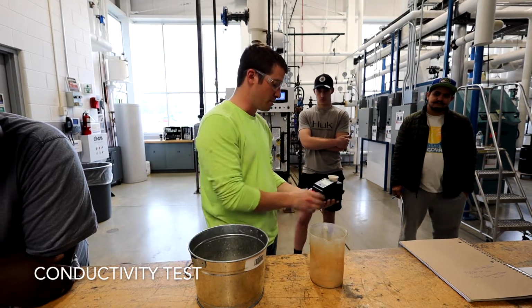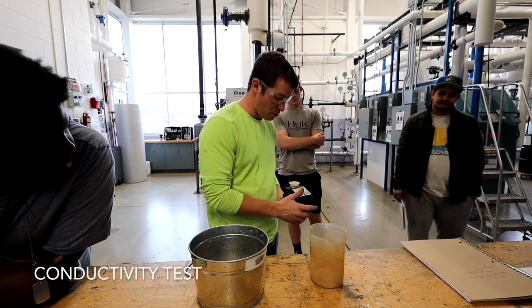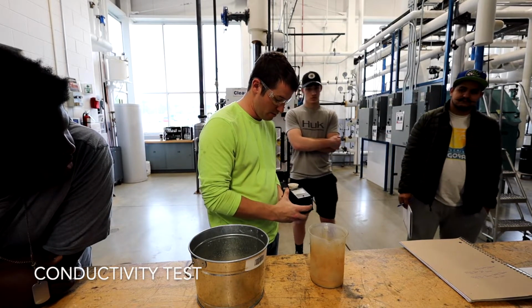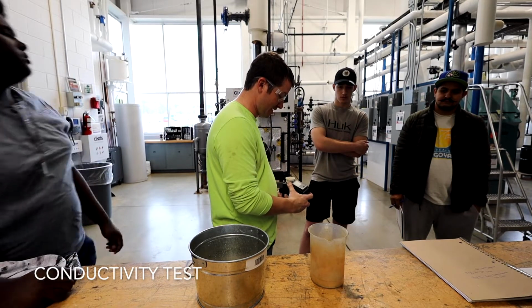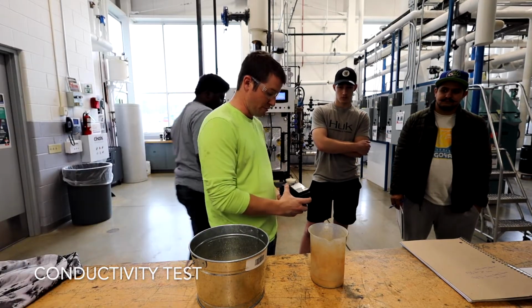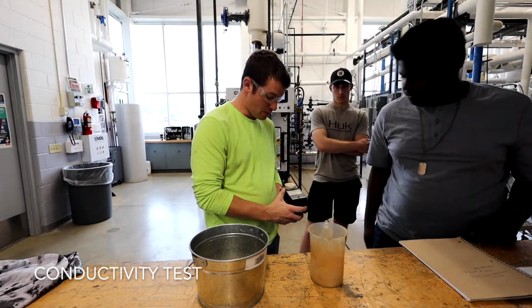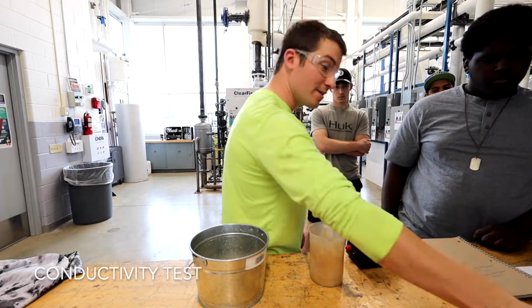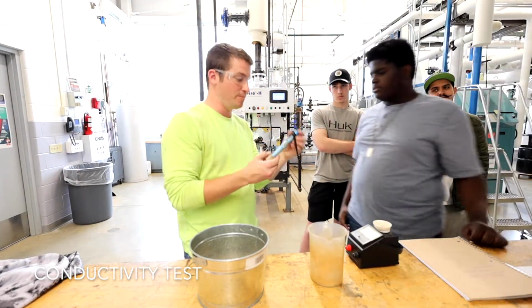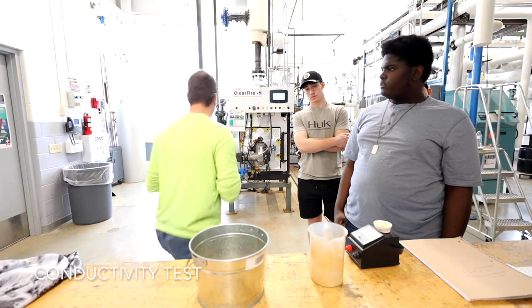And so on this meter, this is an old school one. They still work great. You might have one of these in your boiler room. We're gonna hit this black button and see what it gives us. All right. The only downside of these ones is it's not a digital reading. And when you have a very low number, right, this is sub 100. What is that? So we also then, look at that. We did update at one point. So you maybe have a digital one. This is a pretty basic one. You might have one like this.